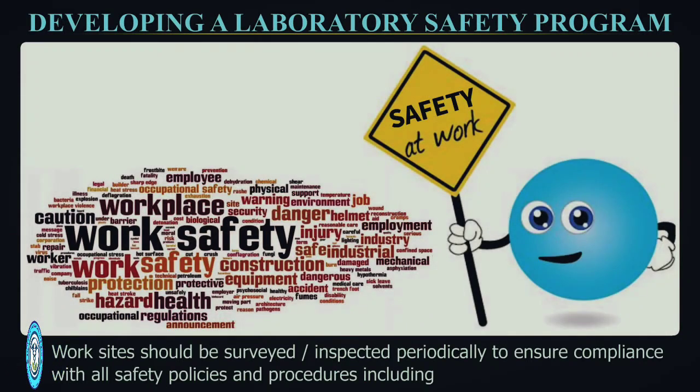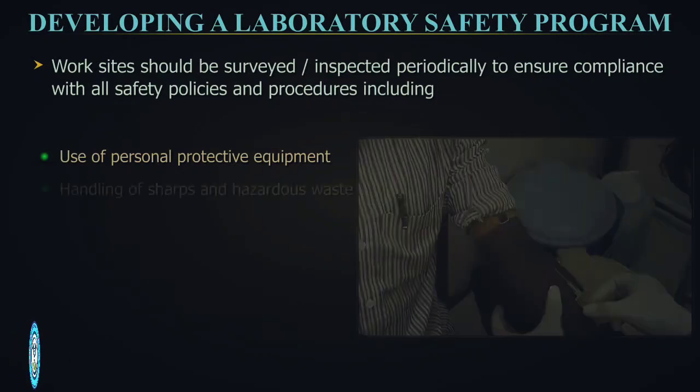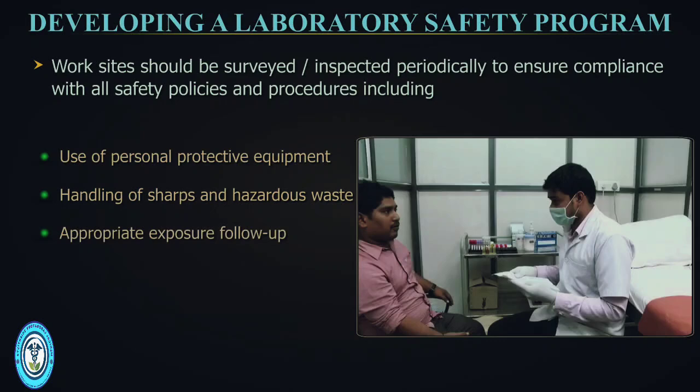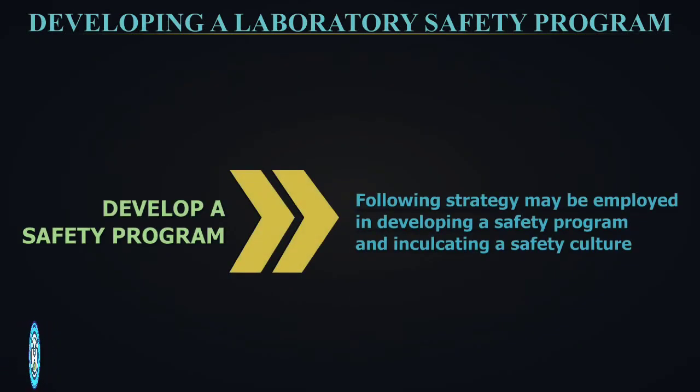Work sites should be surveyed or inspected periodically to ensure compliance with all safety policies and procedures, including use of personal protective equipment, handling of sharps and hazardous waste, appropriate exposure follow-up, documentation of inspection of firefighting apparatus, etc. The following strategy may be employed in developing a safety program and inculcating a safety culture.